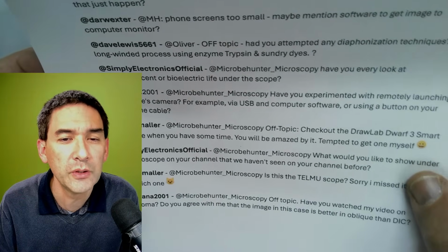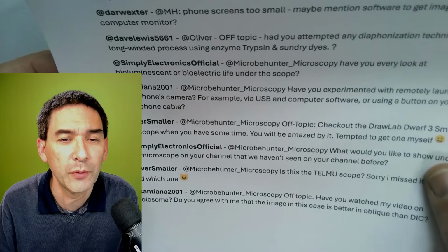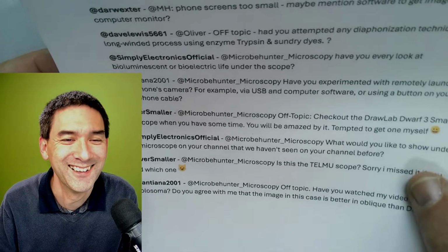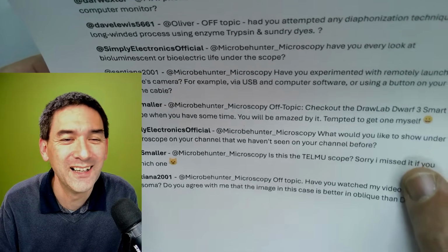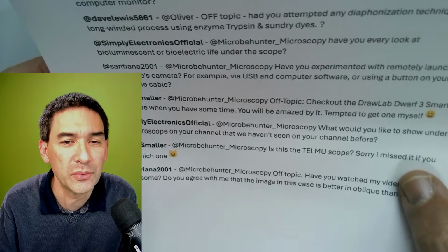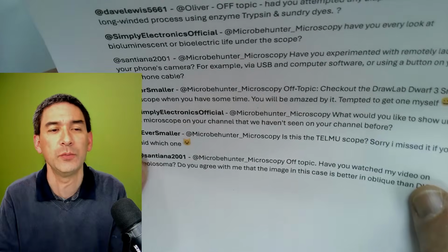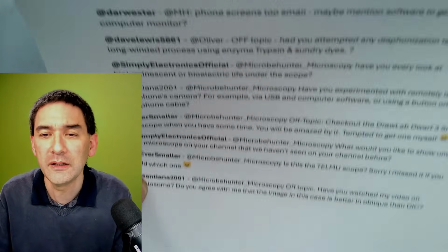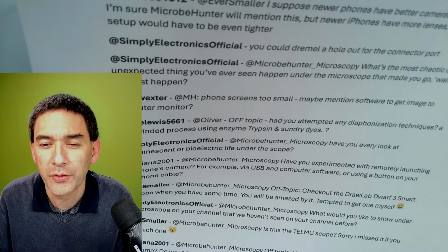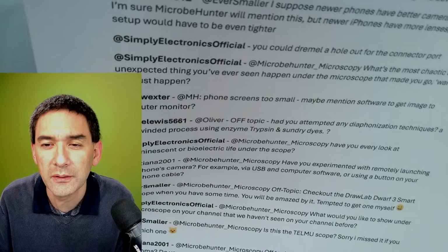What would you like to show under the microscope that we haven't seen on your channel before? Honestly, please make suggestions. It's not the Telmoscope, but it's similar to it. And have you watched my video on that? Yes, I did watch that, I already talked about that. So let me quickly look. DwarfLab Dwarf 3. Okay, thank you. Let me have a look here.